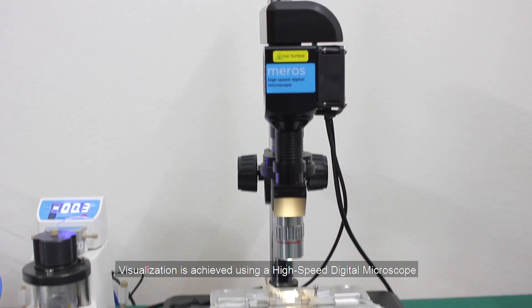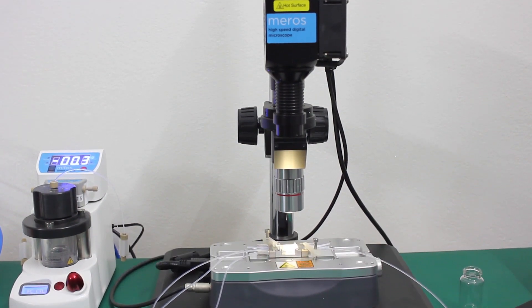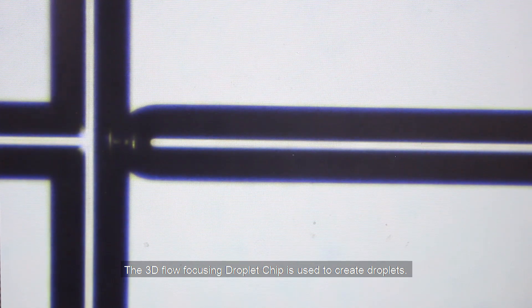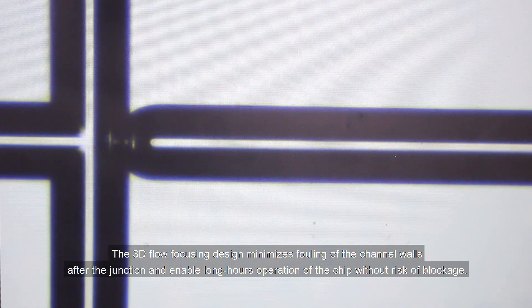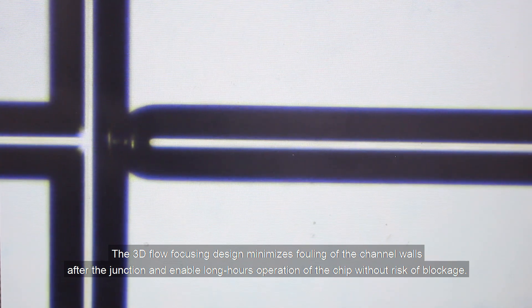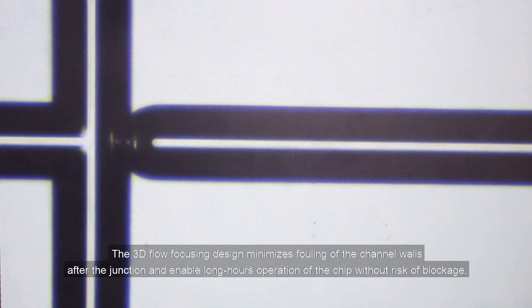Visualization is achieved using a high-speed digital microscope. The 3D flow-focusing droplet chip is used to create droplets. The 3D flow-focusing design minimizes fouling of the channel walls after the junction and enables long hours of operation of the chip without risk of blockage.